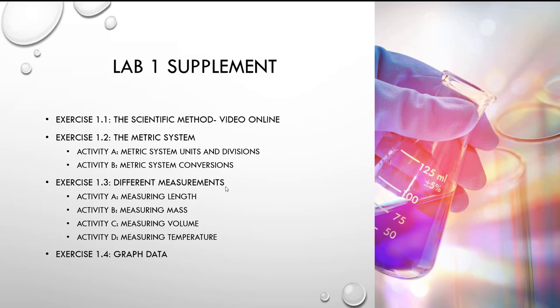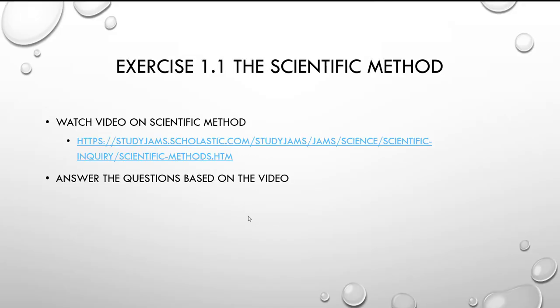We'll also learn how to measure things. So we have our different units: length, mass, volume, and temperature. So we'll learn how to do that using the metric system. And then finally, we'll learn how to graph data, okay? So that's all in the lab supplement.